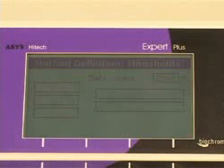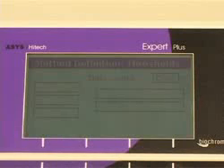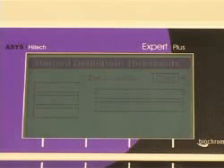Factors and thresholds for the specific test being run can be entered on the relevant screens.